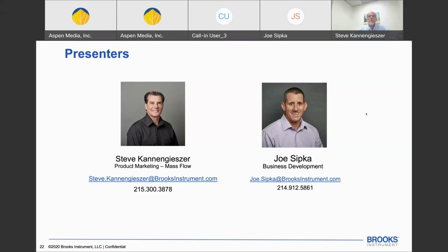All right, that's a great segue. This next question is that someone would like to know, can you guys provide on-site calibration and NIST traceable reporting to some of the core biotech hubs, South San Francisco, et cetera? Definitely, our core competence for Brooks. Finding who to contact is on our Brooks website.